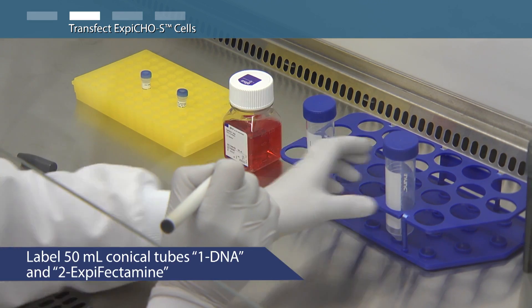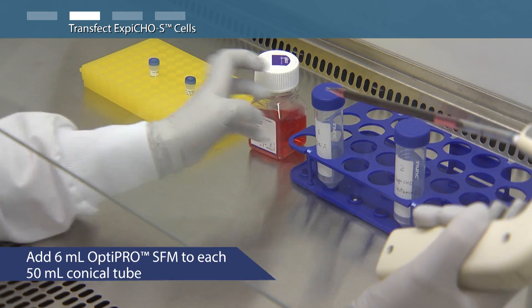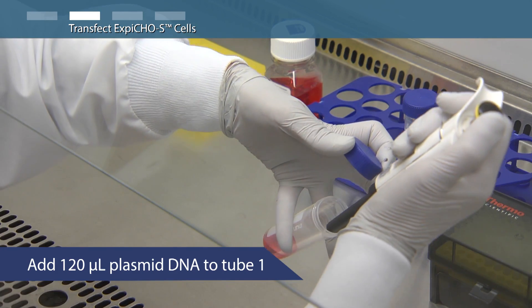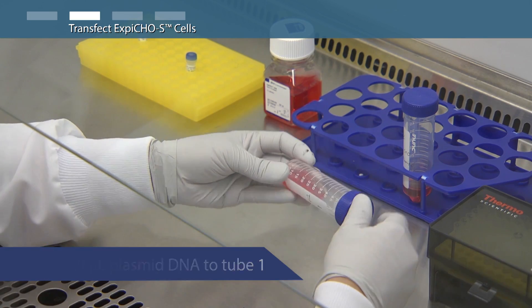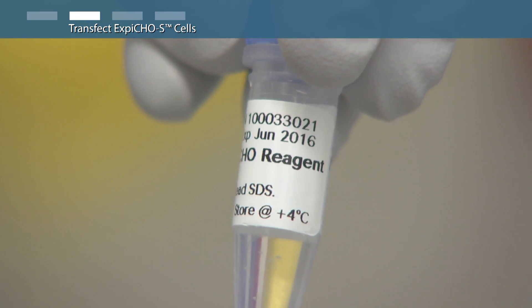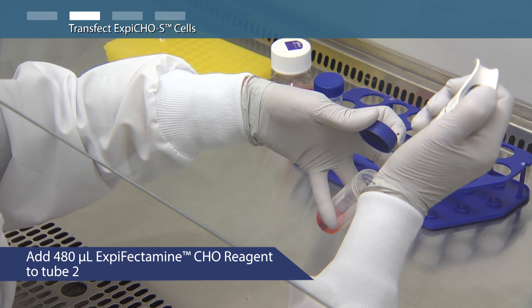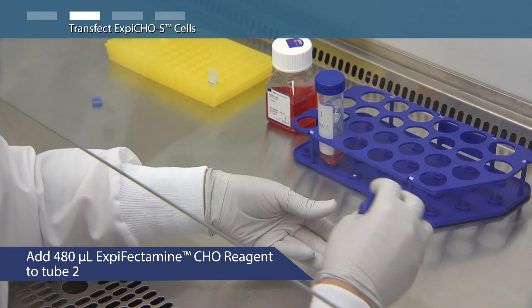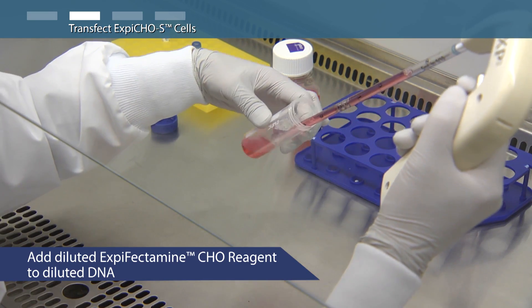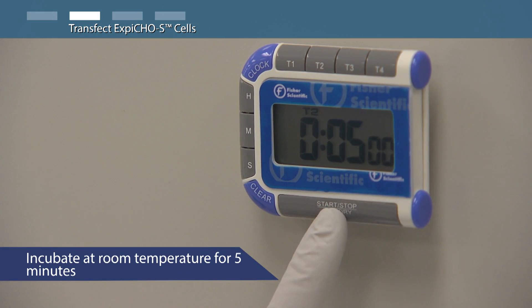Label one 50 milliliter conical tube as '1 DNA' and another as '2 ExpiFectamine.' Add 6 milliliters of OptiPro serum-free medium to each 50 milliliter conical tube. Add 120 microliters of plasmid DNA to tube 1 and mix well by swirling — do not vortex or pipette vigorously. Gently invert the ExpiFectamine reagent 4 to 5 times to mix thoroughly. Add 480 microliters of ExpiFectamine reagent to tube 2 and mix well by swirling. Then add the diluted ExpiFectamine reagent to the diluted DNA and mix well by swirling.